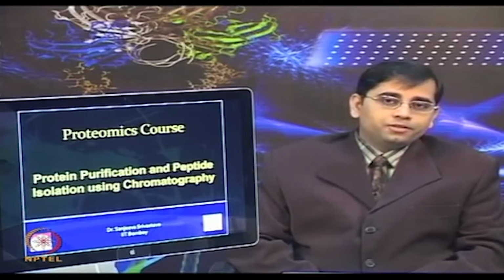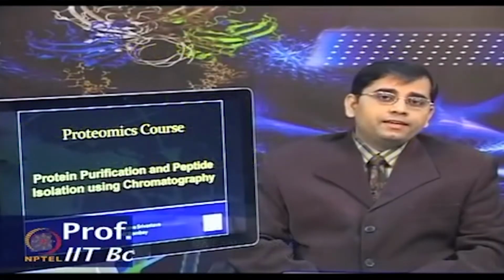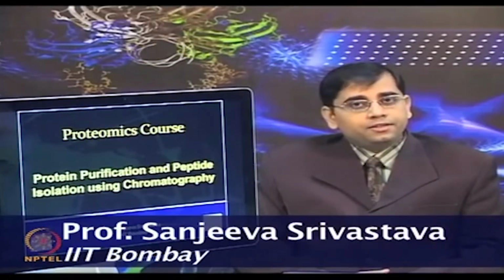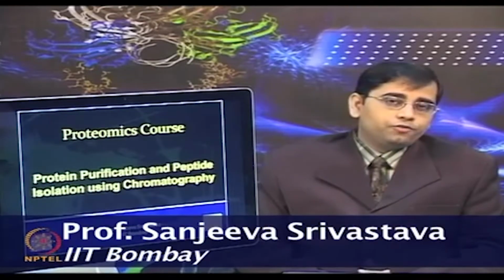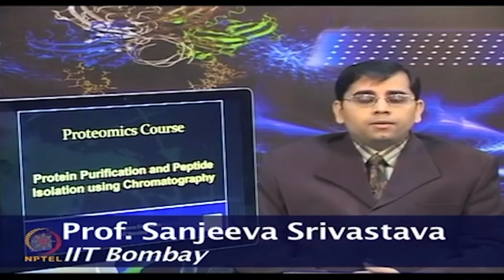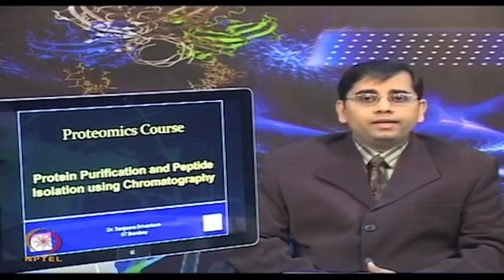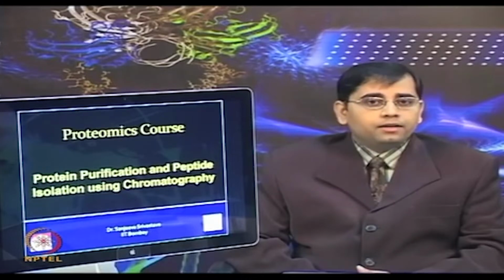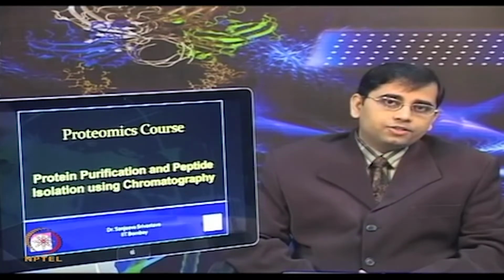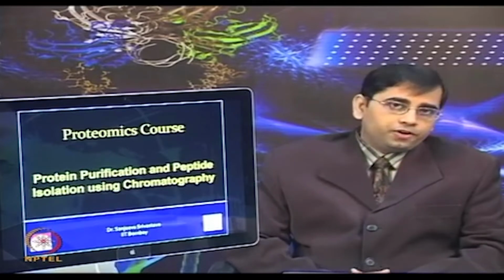Today we will talk about protein purification and peptide isolation using chromatography methods. The chromatography techniques have always been considered prominent for the separation of enzymes and proteins. Protein purification by conventional chromatography is usually achieved by combining chromatographic methods such as gel filtration, ion exchange and affinity chromatography.